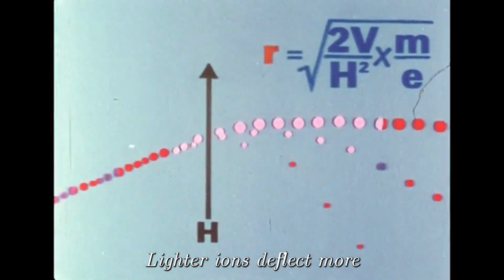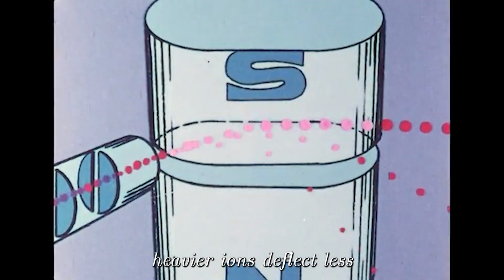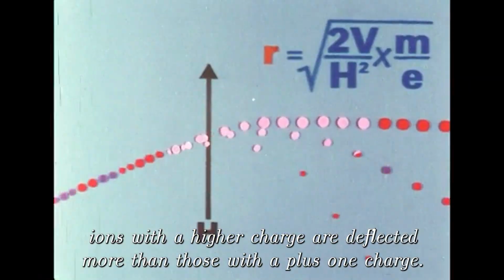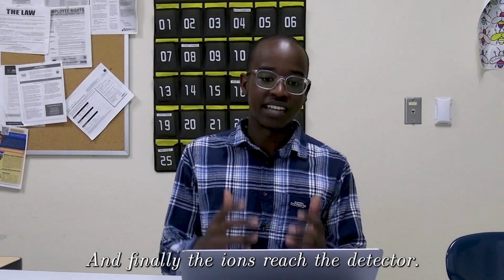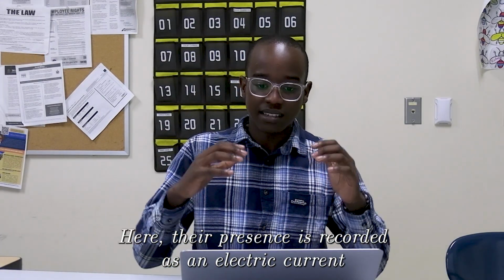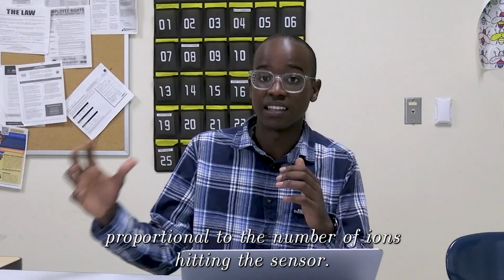Lighter ions deflect more, heavier ions deflect less, and ions with a higher charge are deflected more than those with a +1 charge. And finally, the ions reach the detector. Here, their presence is recorded as an electric current, proportional to the number of ions hitting the sensor.